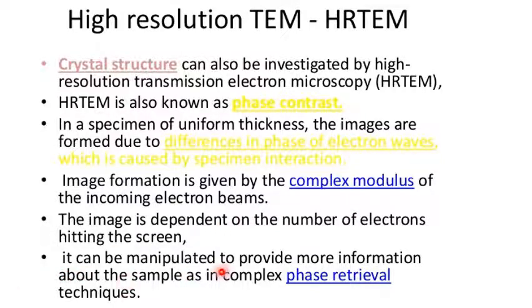The image can be manipulated to provide more information about the sample, as in complex phase retrieval techniques. So from the images we get the results; we manipulate the images and get the results from the images.